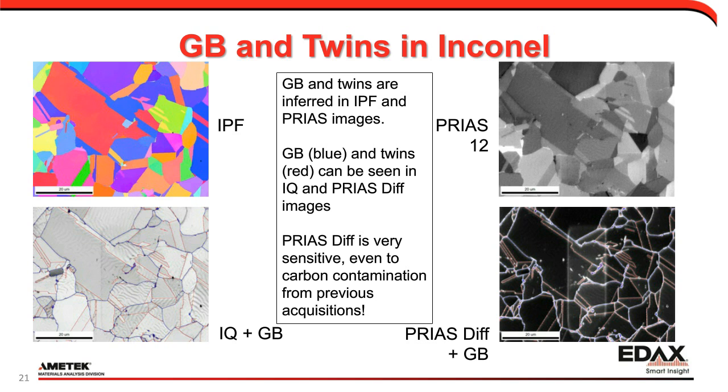An interesting side note is the sensitivity of the PRIAS differential image to the carbon contamination from a previous acquisition that appears. Sometimes contrast mechanisms are produced from an unexpected source.